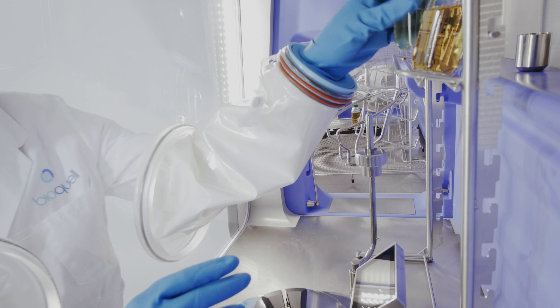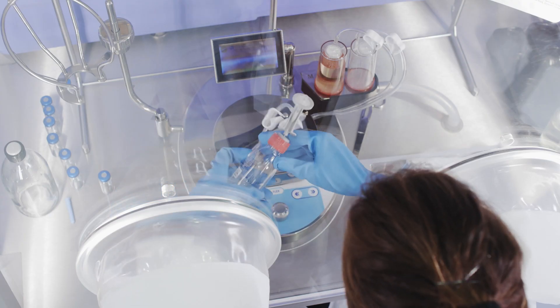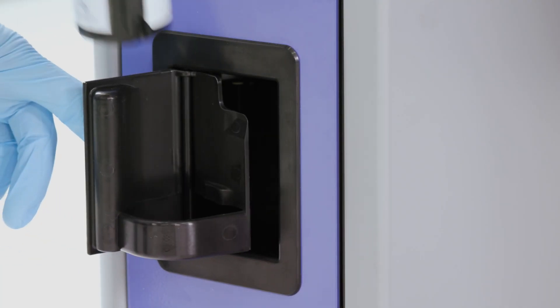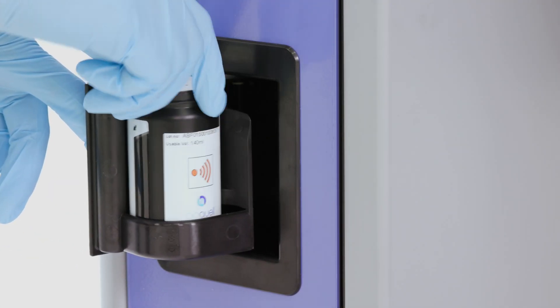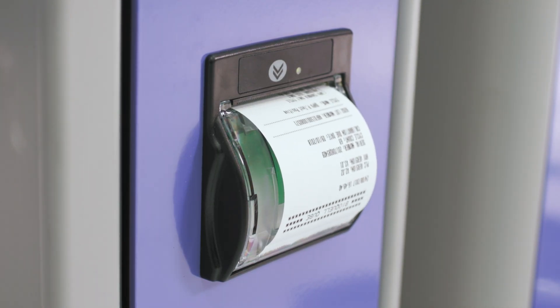Aiding in a highly optimized and thoroughly efficient workflow. At all times, you have full traceability and regulatory compliance through RFID tags on hydrogen peroxide models, environmental monitoring and integrated cycle reports providing detailed cycle parameters.